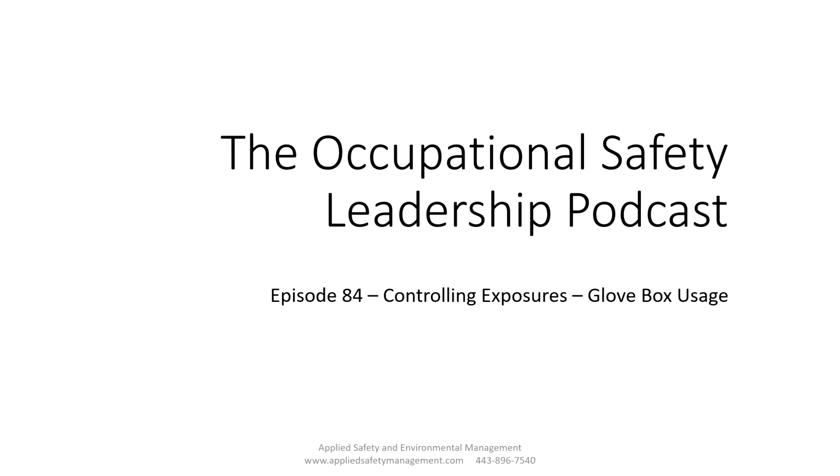In today's episode, we're going to talk about controlling exposures with a glove box. So basically, a glove box is a specialized enclosure, so for doing specialized things. So that's a very vague introduction. So let's get started.